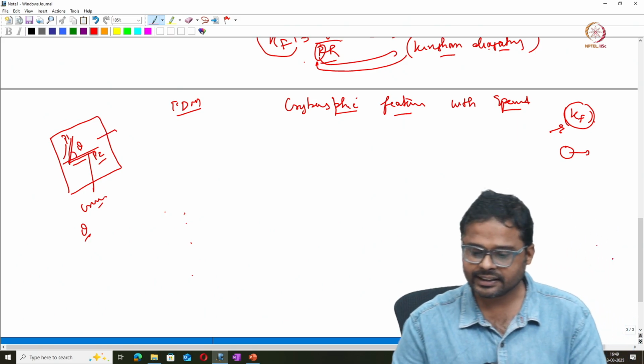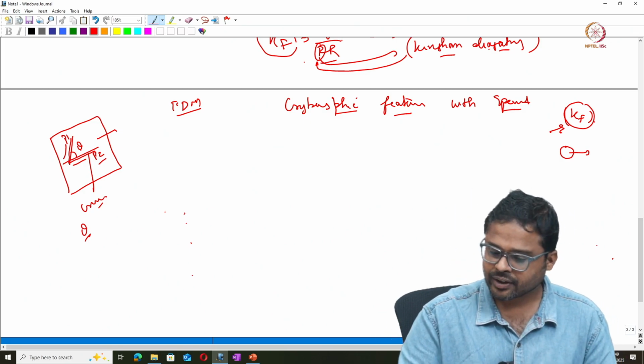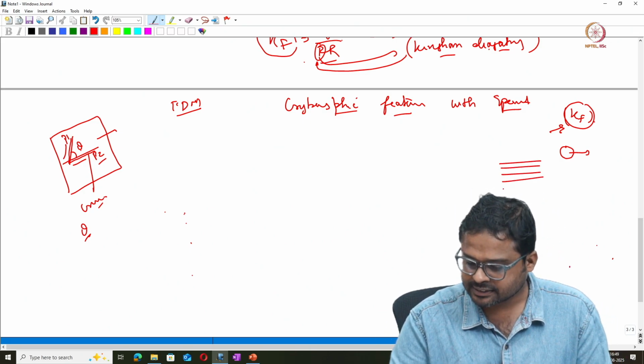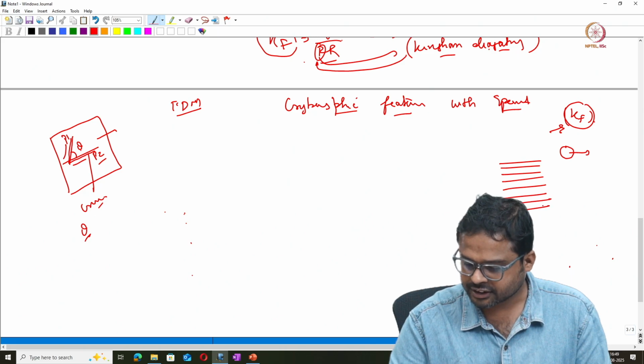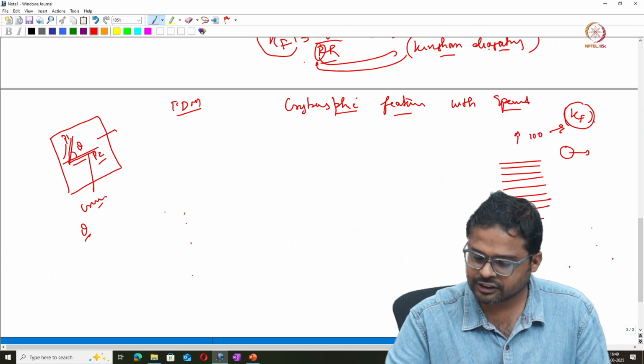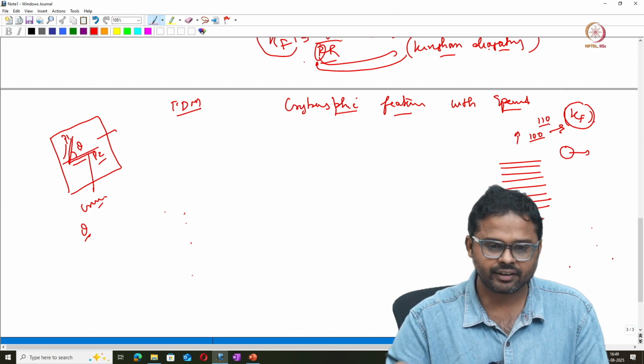Another way is if you have a pole. In the last class, I showed you atomic planes in the reconstruction. These atomic planes have a certain pole, either a 100 or 110 crystallographic axis.